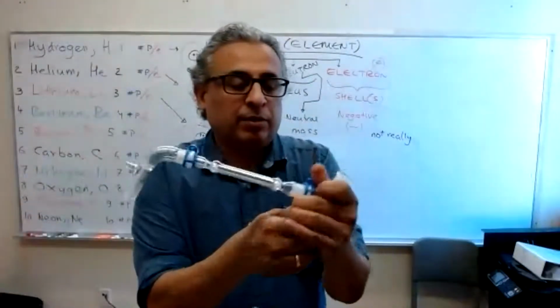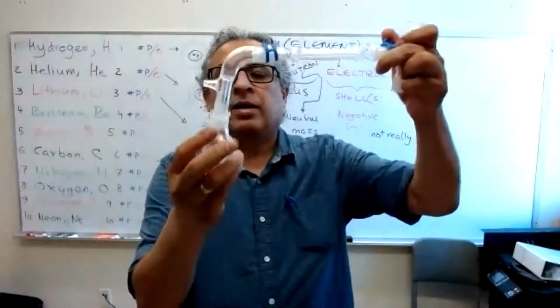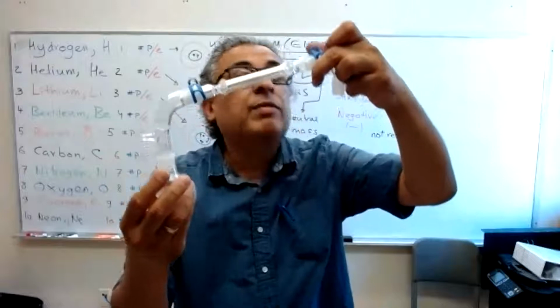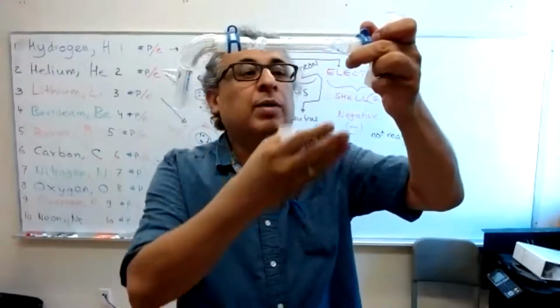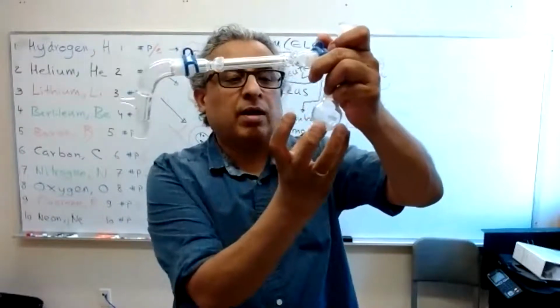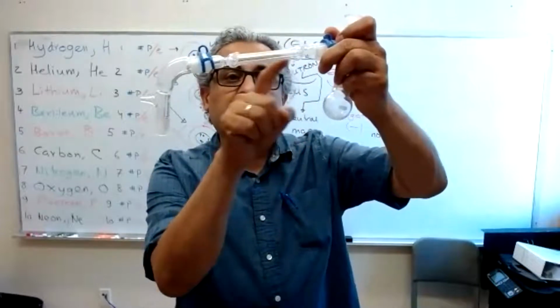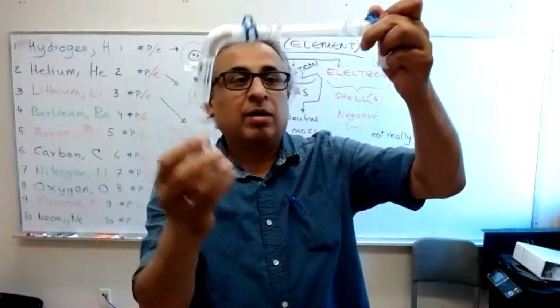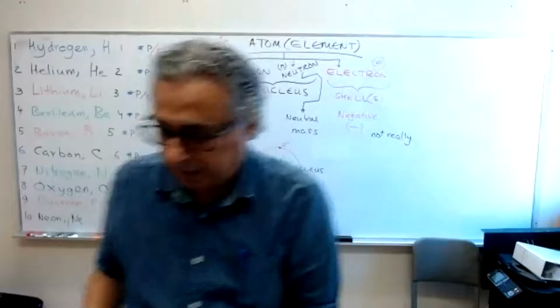You can collect the distillate here, and then you can have a bigger flask there. You can distill whatever you're distilling from there into here. Let's say you have beer and you want to just get the ethanol out. So you put your beer here in a large flask and heat it up. The low boiling liquid will distill first, and then you collect the alcohol here, and it'll pretty much leave the water down here. Okay, that's the whole idea. So that's that.